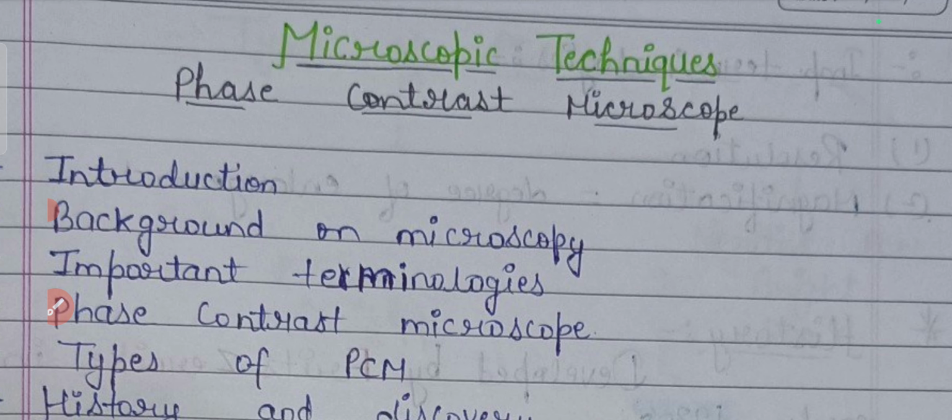First of all, we are going to start the topic that is the phase contrast microscope.